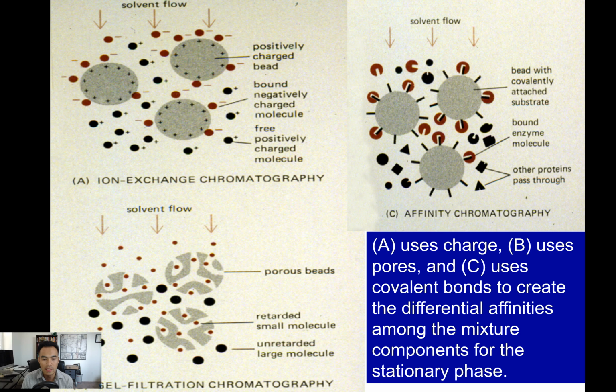To conceptualize this idea, I want you to think about what are some charges or forces that were involved in this specific experiment. We've already talked about dipole-dipole, hydrogen bonds, and London dispersion forces as being these intermolecular forces. The whole point of this lab was to really understand how these forces interact with each other when the dyes begin to separate and as they're also traveling across the paper. So we have three different examples here to illustrate that concept.